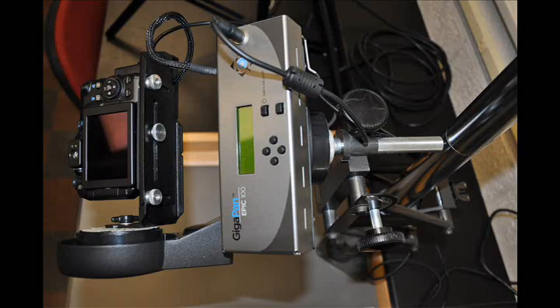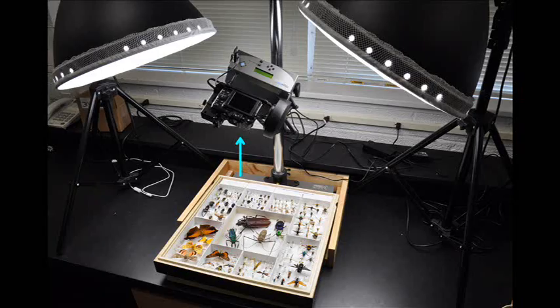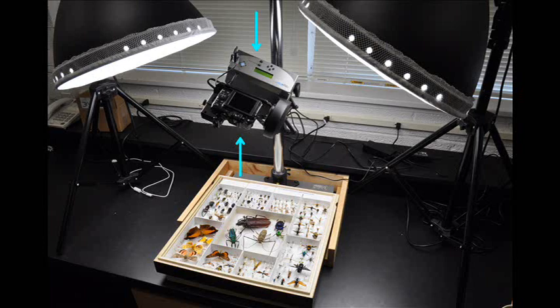Once the settings are selected and the camera is attached to the GigaPan robot, the entire unit can then be attached to the threads on the copy stand. The camera lens should be facing the table, with the robot's controls facing up and accessible to the user.